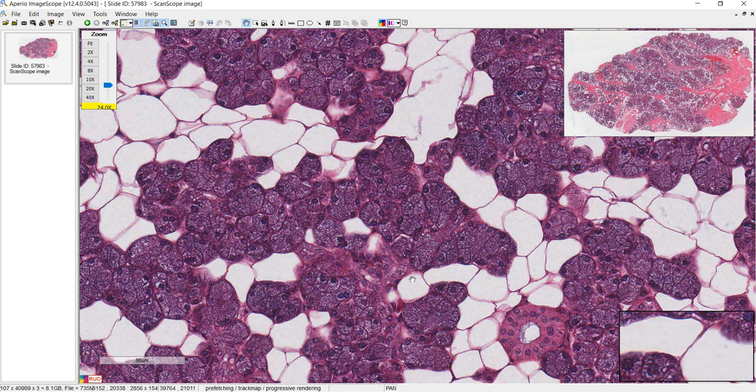And these are not mucus glands. These are actually fat cells, so they're adipocytes. All right, so here's one serous cell. Here's another one. And when they're grouped together like this, it's an acinus. So you can see lots of acini all over the parotid gland.